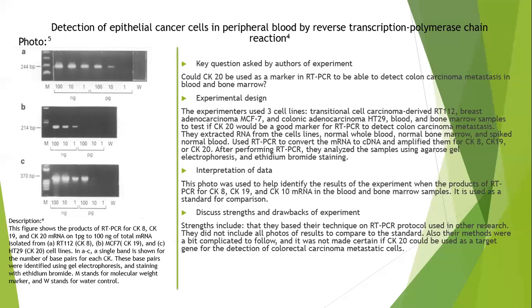This photo was used to help identify the results of the experiment when the products of RT-PCR for cytokeratin 8, cytokeratin 19, and cytokeratin 20 mRNA were examined in the blood and bone marrow samples. It's basically just used as a standard for comparison.